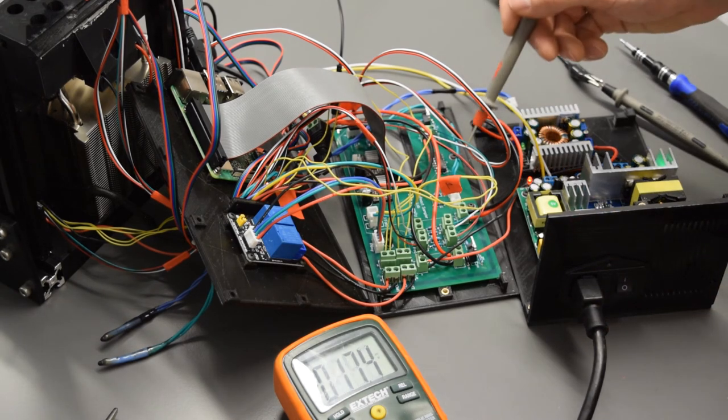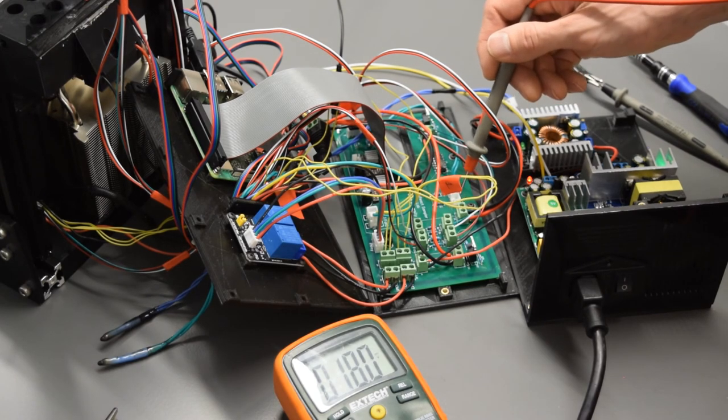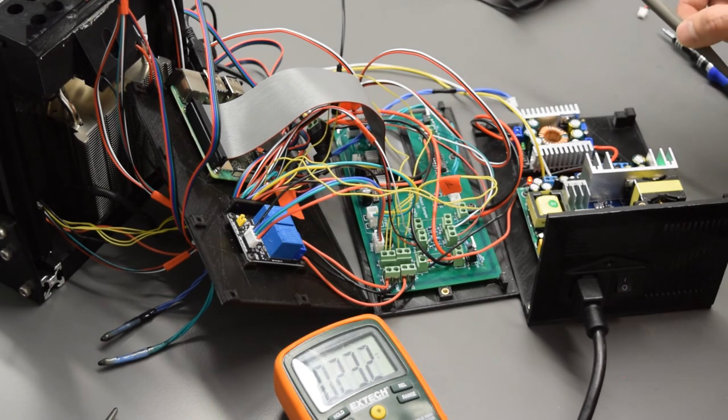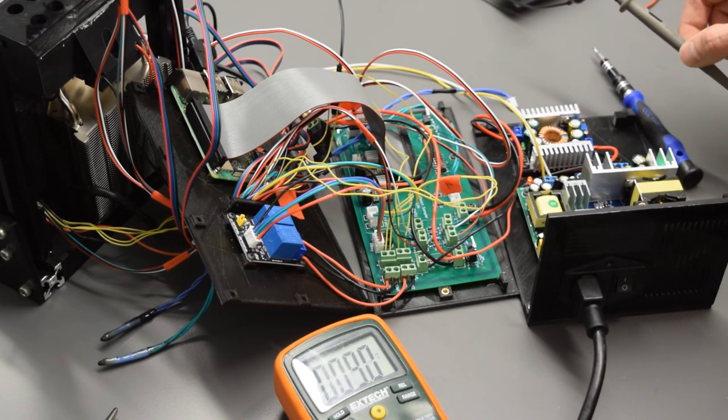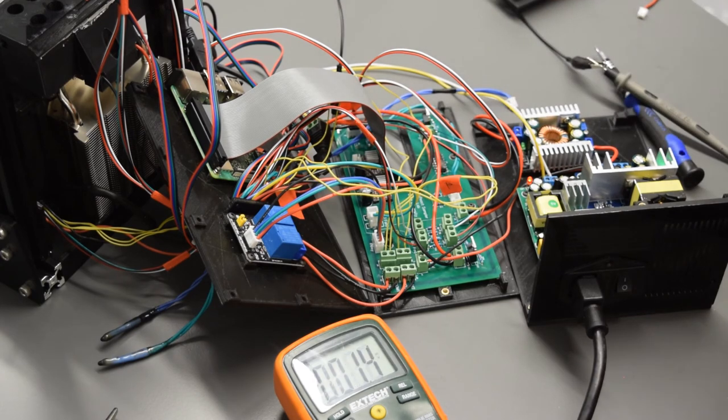Then you're going to unplug one of your thermal probes. So I've unplugged thermal probe 2 here. This is an empty socket. Next, I have my ground lead again attached to an alligator clip, which is grounded on the PCB on one of those pads.